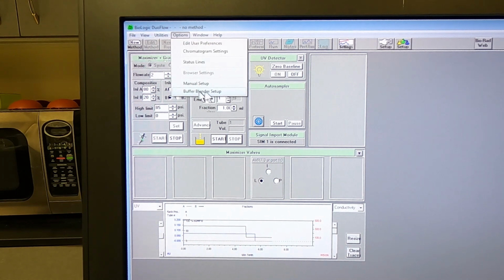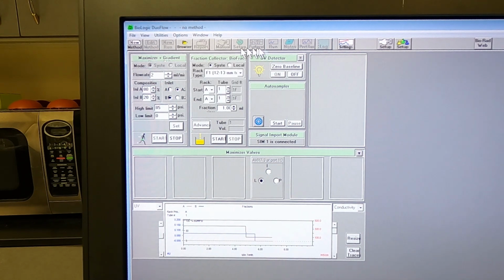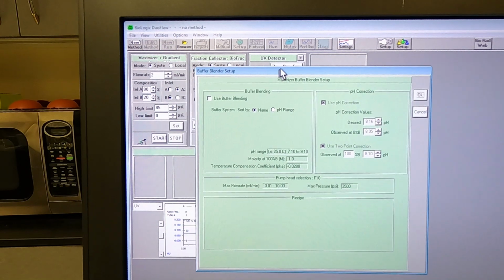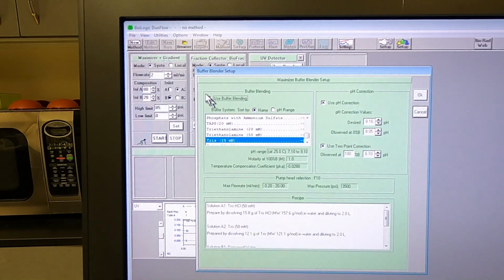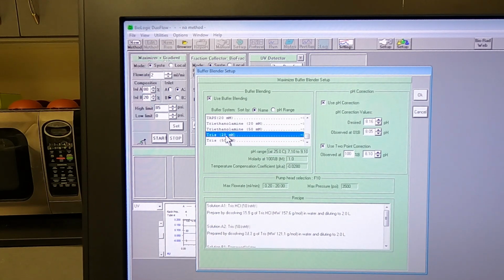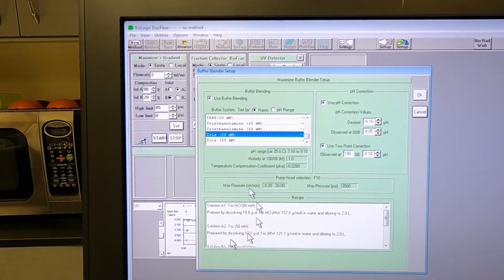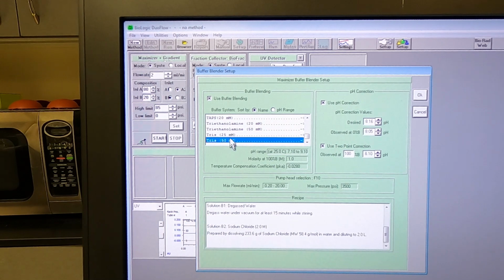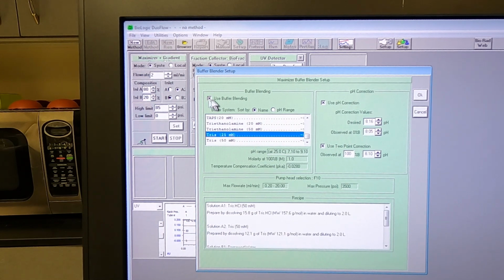So buffer blender setup can be accessed here. Again, these little quick buttons here. So we'll open our buffer blending setup menu again, and we're going to turn it on. Depending on what system you use, there's a lot of presets. We usually use the Tris system, and then down here it's going to tell you what the recipes are and also which line to put the buffers on. Well, we've got our buffering system selected and we've checked the box for use buffer blending. So watch how this changes here when I push OK.